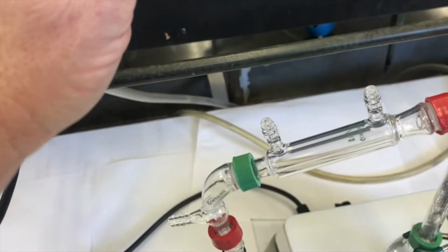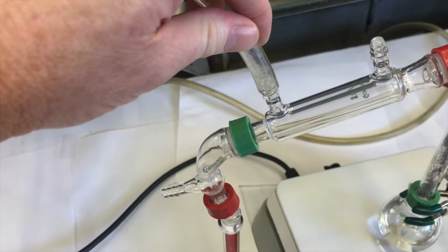And okay, now I need to also set up my hoses. So over here, our water aspirator, I normally have the splash guard down here, right? And I usually hook up hoses to the sidearm for vacuum, but today we don't want vacuum, we want water. So I'm gonna hook up a hose to the bottom where that splash guard usually is, where the water runs out. And then this is important, we wanna have a good water-cooled condenser. So I wanna hook this condenser up a certain way. I wanna hook up the water coming out of the tap. I want it to enter the low end. This is the low end, this is the high end.